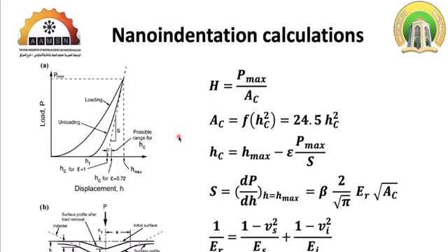In the traditional hardness test we take an image of the impression and, based on the diameter or the two diameters, we calculate the hardness, totally ignoring the elastic behavior within the material. As long as we can separate the elasticity from the plasticity, we can get information about the plasticity by using this equation.